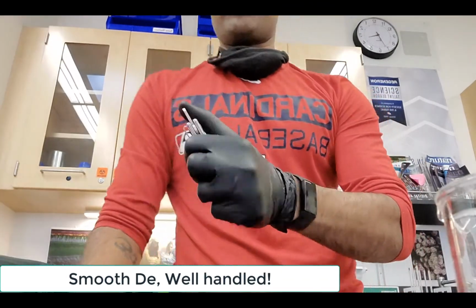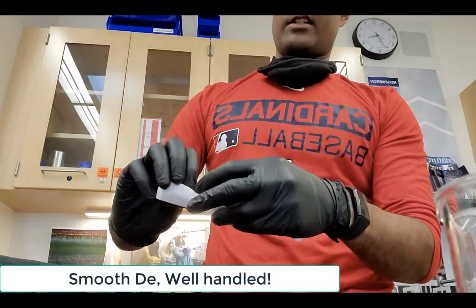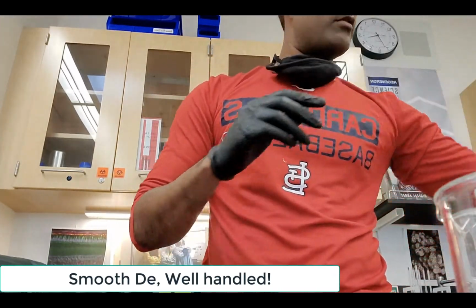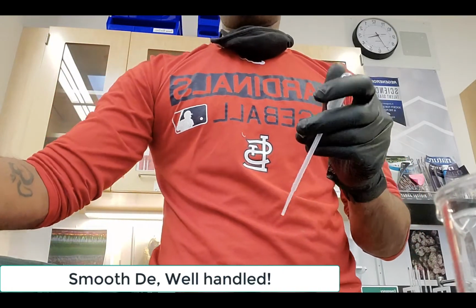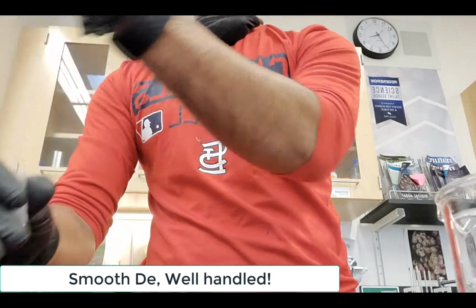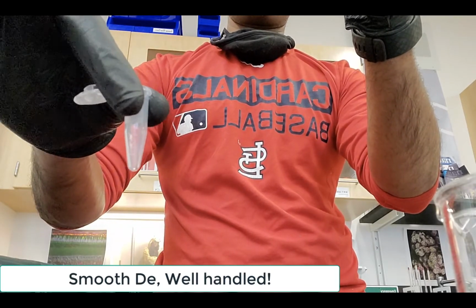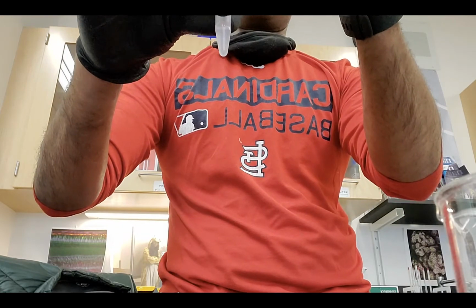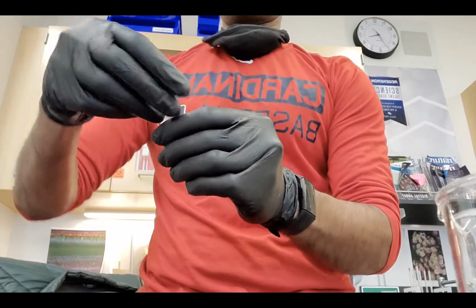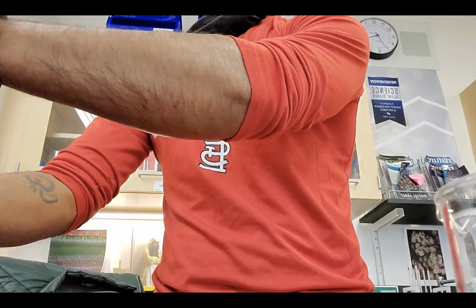Okay, I can't get my disposable pipette open. So we're just going to cheat. Okay, so I've got my disposable pipette. I'm going to take some of the solution. Oh, sorry, wrong tube. I'm going to put it in my 1.5 mil microcentrifuge tube. Fill it up to the top. I'm going to throw my pipette into the dump beaker, put my microcentrifuge tube down, close up my Falcon tube.